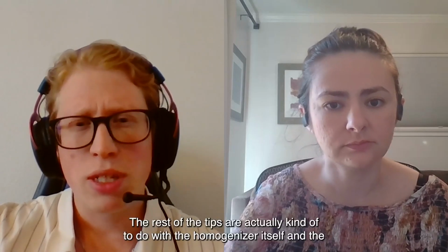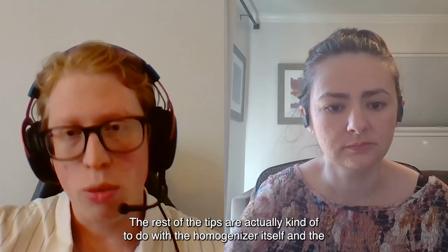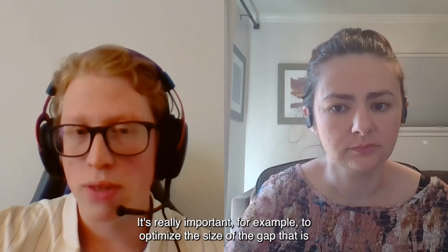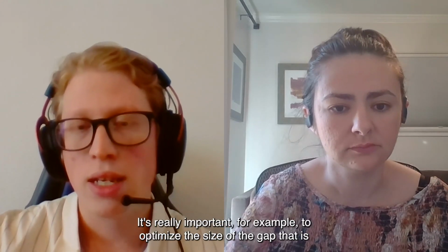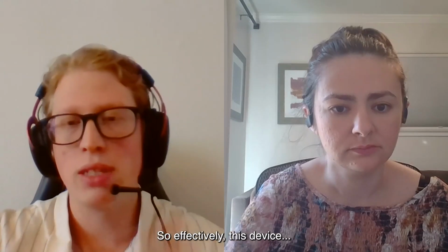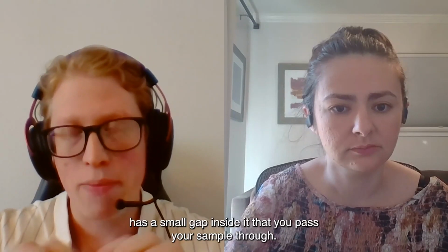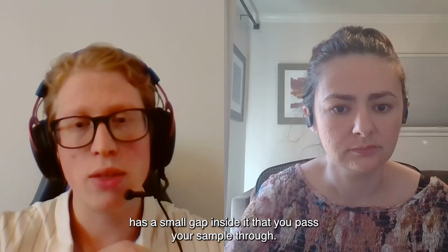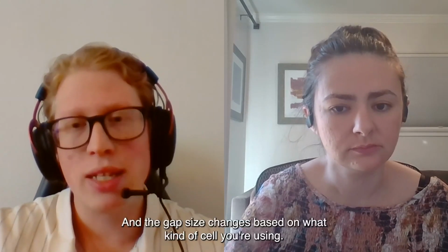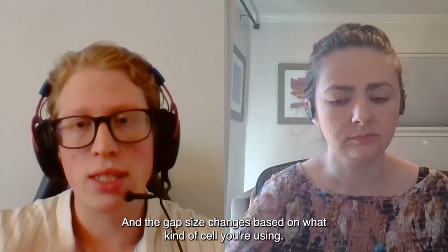The rest of the tips are actually kind of to do with the homogenizer itself and the homogenization process. It's really important, for example, to optimize the size of the gap that is inside the device when you homogenize. So effectively, this device has a small gap inside it that you pass your sample through. And the gap size changes based on what kind of cell you're using.